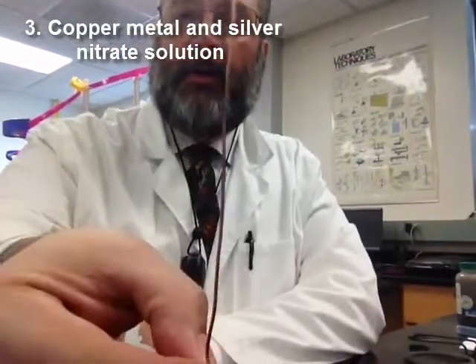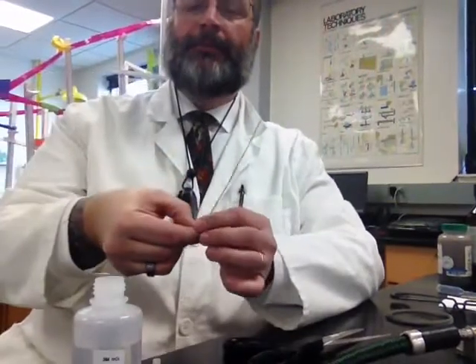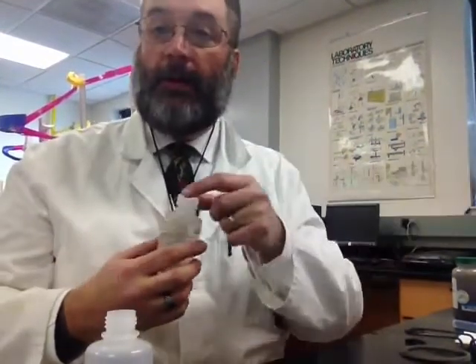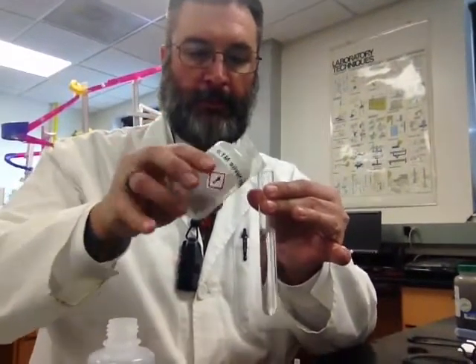So, I have here a piece of copper wire. Okay, you see that? That's copper wire. Sort of, well, it's copper color, right? And I'm going to use this copper wire with another solution. And this solution is called silver nitrate. Silver nitrate solution. So I'll show you what that looks like before I do anything. Silver nitrate. Again, another clear, colorless solution.